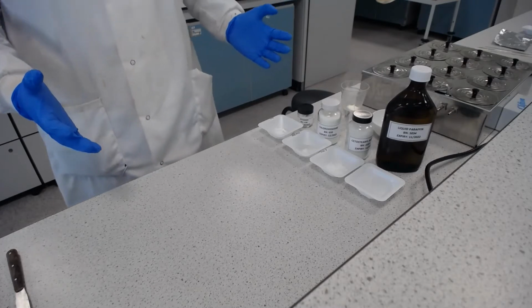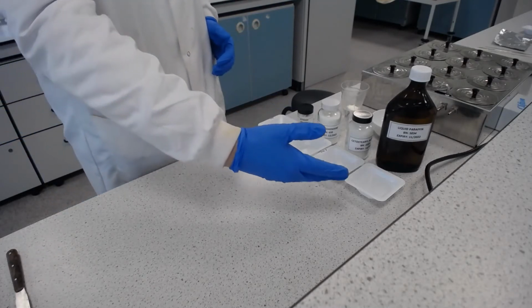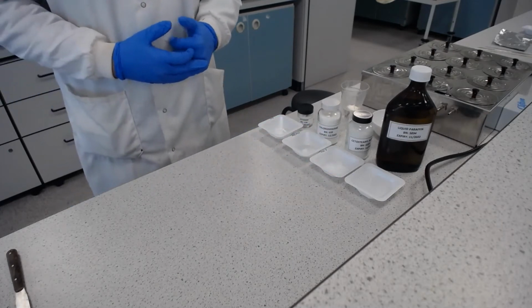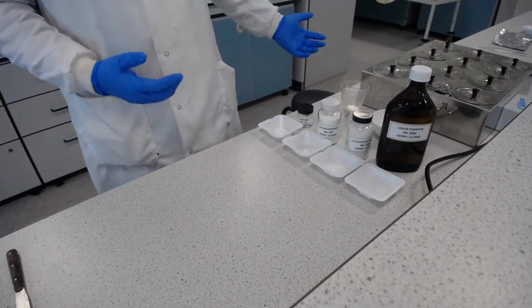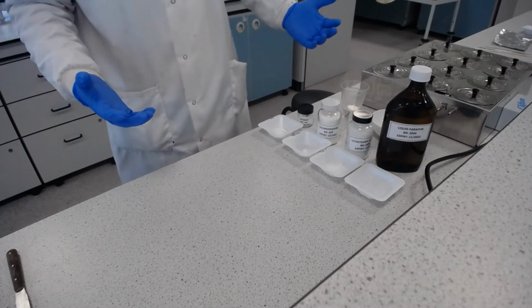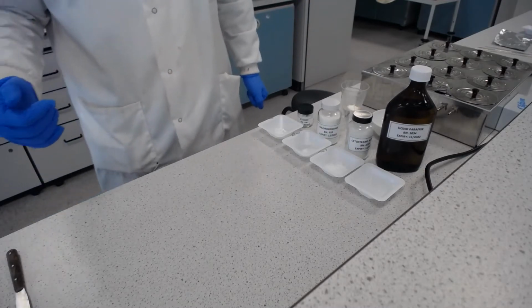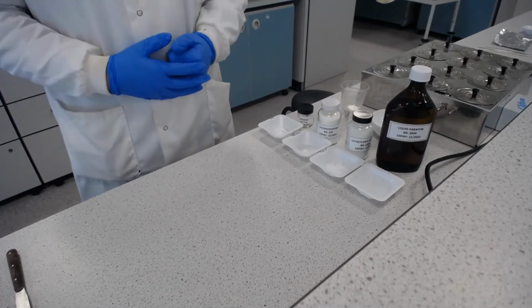I'm going to go ahead and assume that you have done all of the pre-work in the lab book, and I will just get straight on with doing the practical side and just change the camera angle now. Here you can see I've got everything set up and ready to go for us to make our cream. Now I've previously weighed everything out because by this point hopefully you're happy with how to use a balance accurately, and we don't need to waste time with you seeing me doing that. So I'm just going to go through the method and the instructions that I've got written down in the lab book now with you so you can follow along.